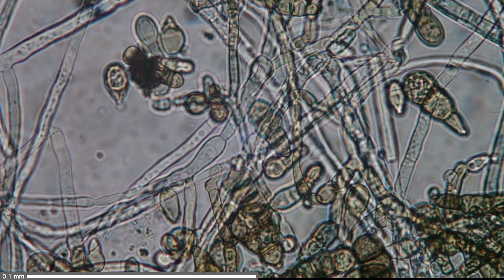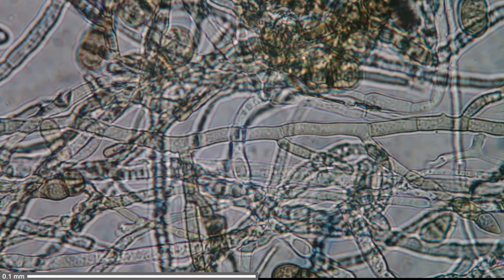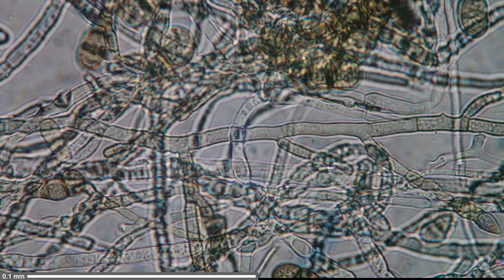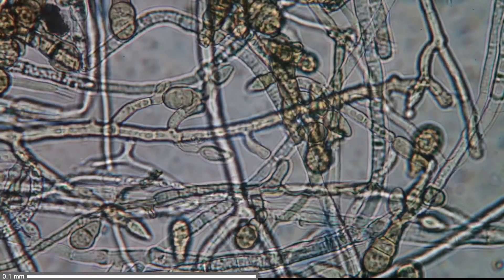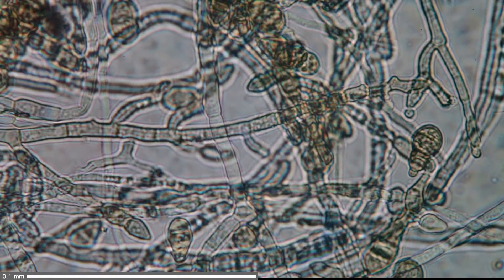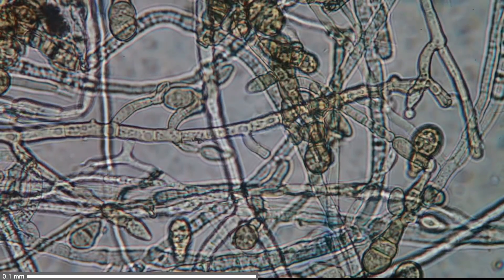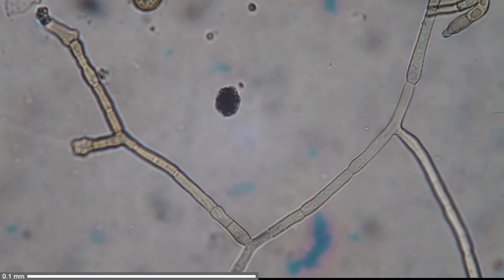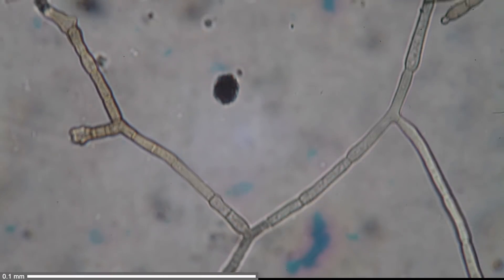I'm focusing back and forth to get different parts of the fungus into focus. If you look very carefully, you can see round, very transparent structures inside some of the cells — those are the nuclei of the fungus. We look at different locations and the focusing back and forth makes parts beneath the plane of focus more visible. This is quite a good specimen — you can see a little bit of color present, the branching of the cells, and the individual cells of the fungus.